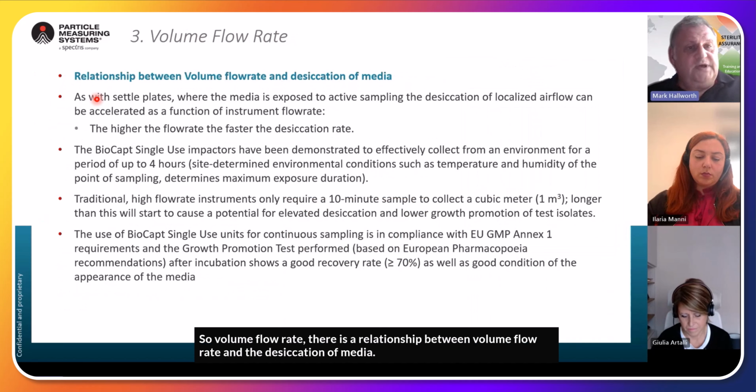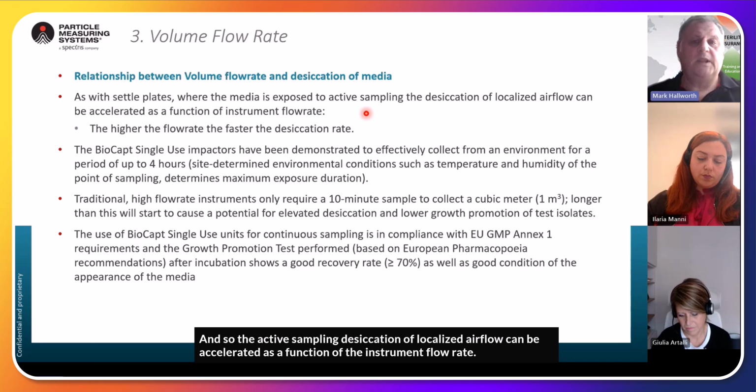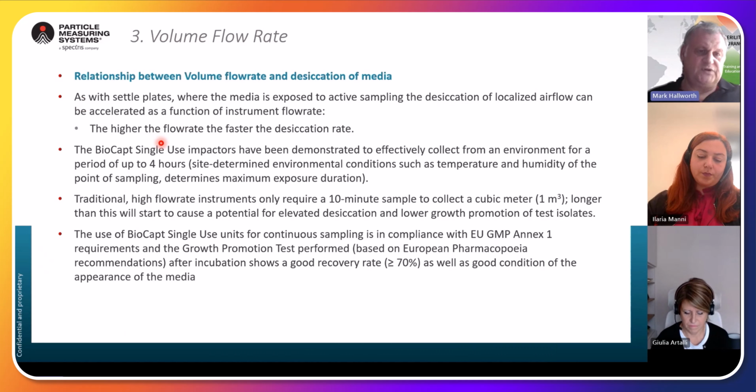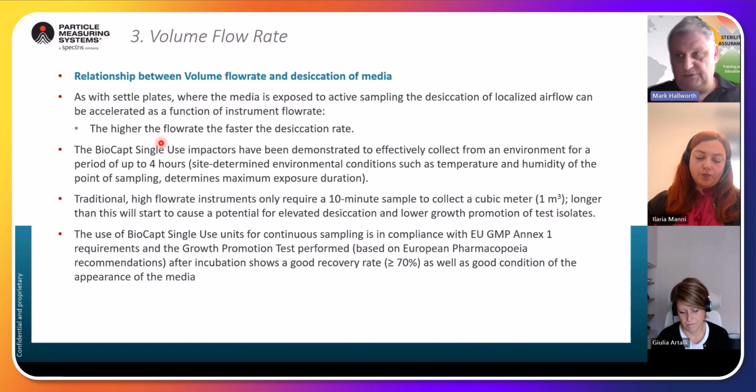So volume flow rate, there is a relationship between volume flow rate and the desiccation of media. The faster the flow rate, the quicker the media will desiccate out. And so with active sampling, desiccation of localized airflow can be accelerated as a function of the instrument flow rate. So the higher the flow rate, the faster the desiccation rate. So the rate is over time.